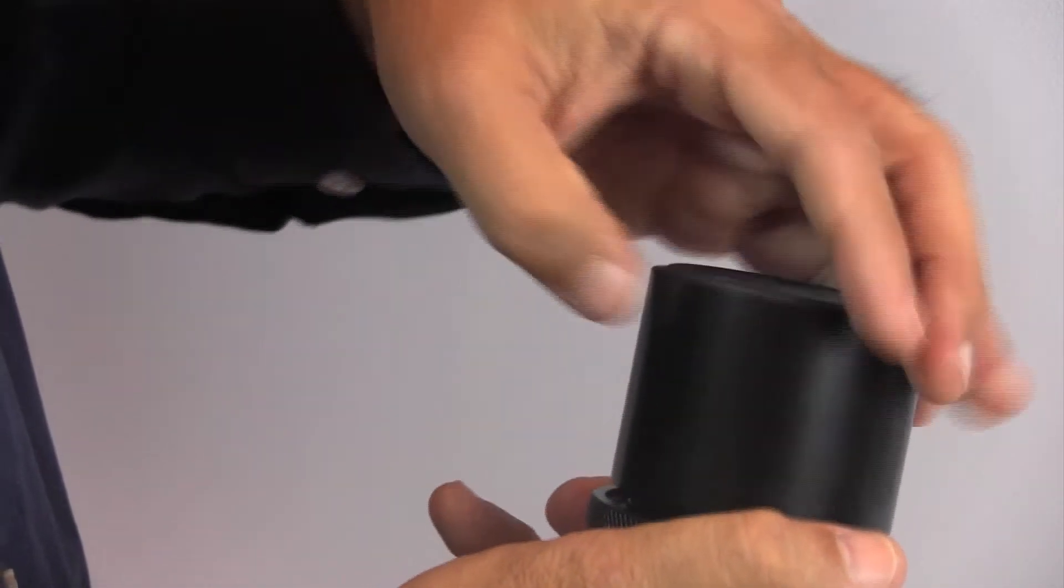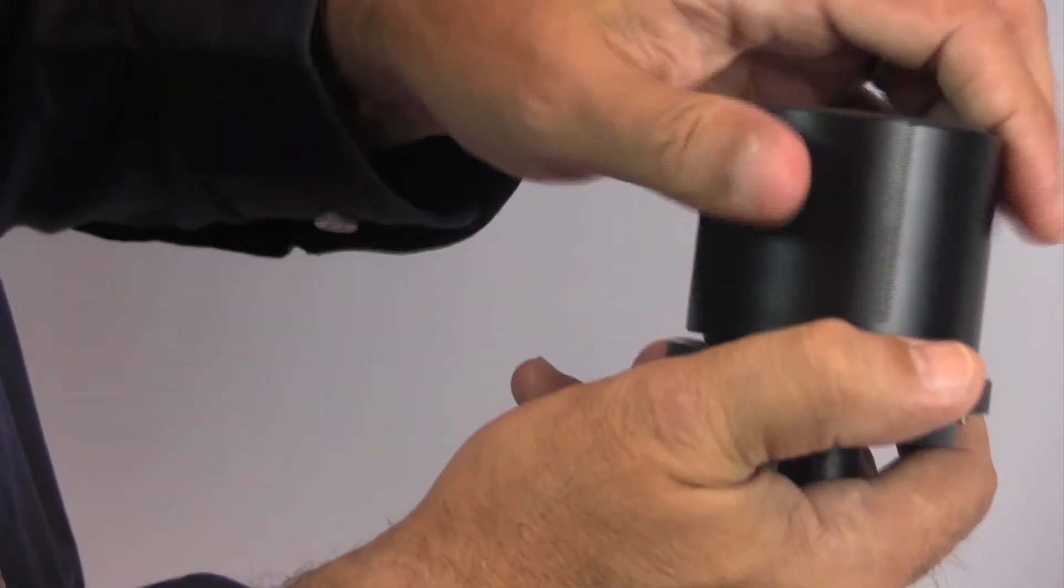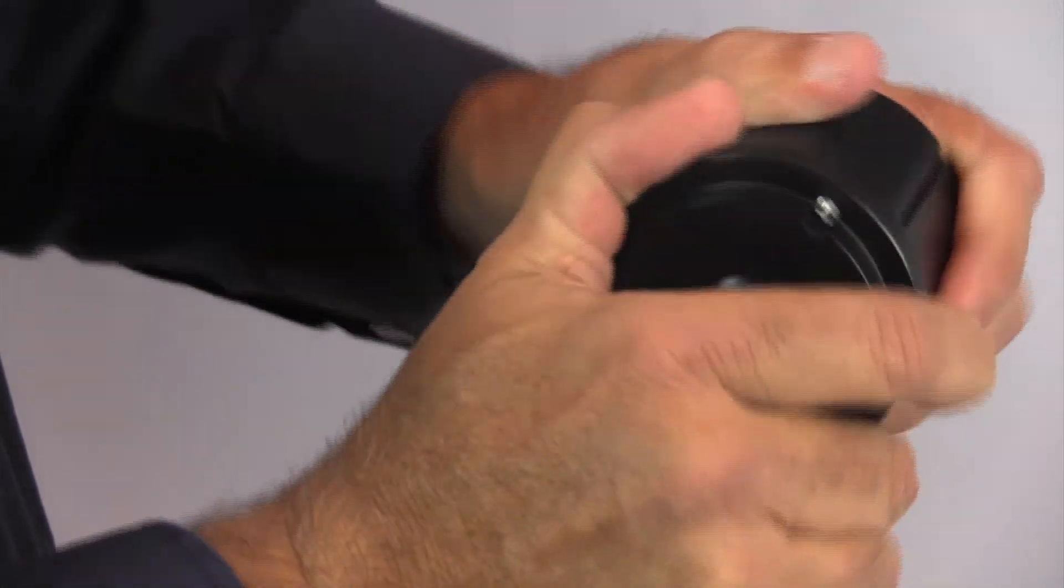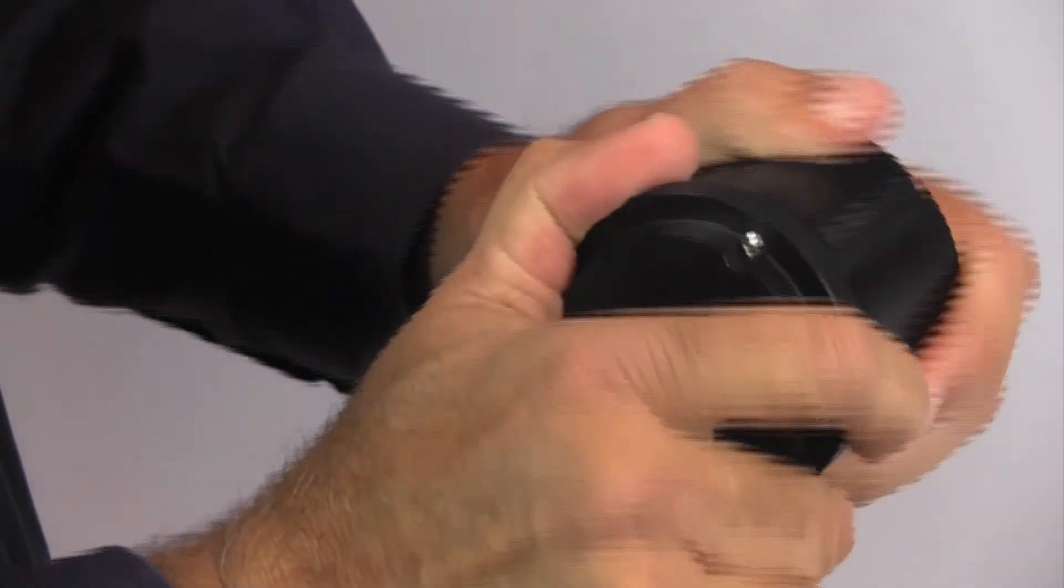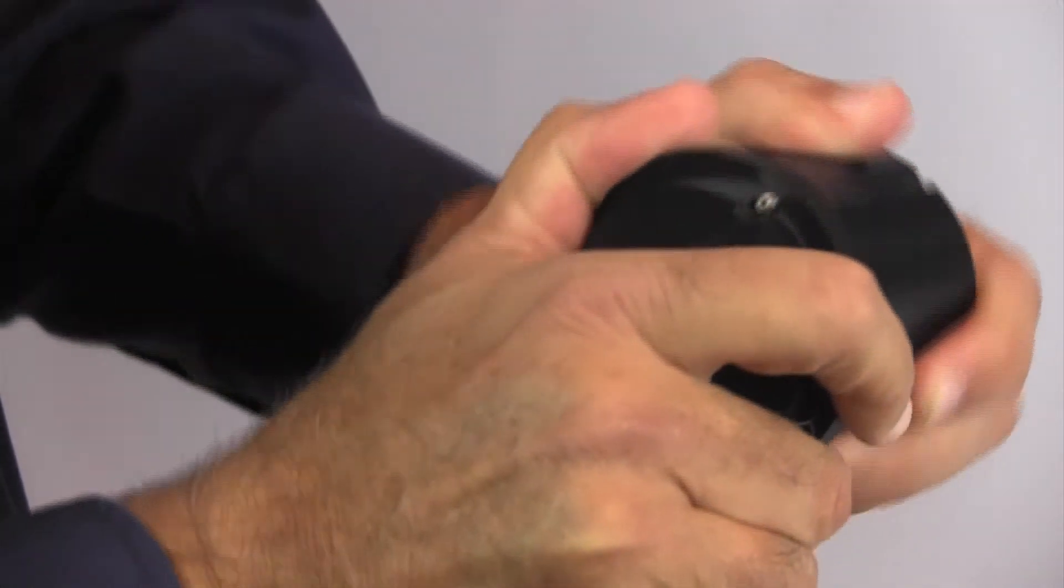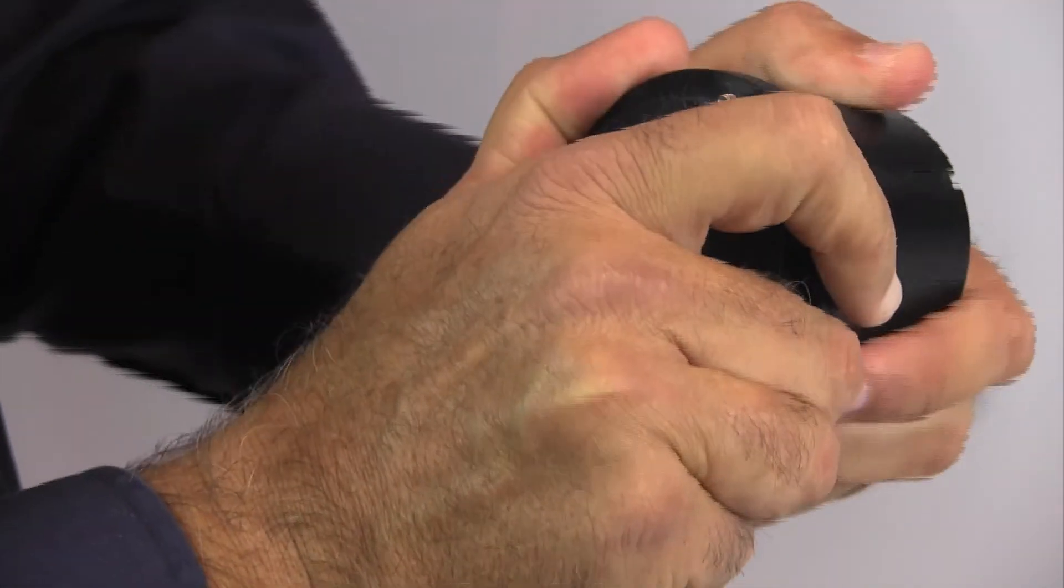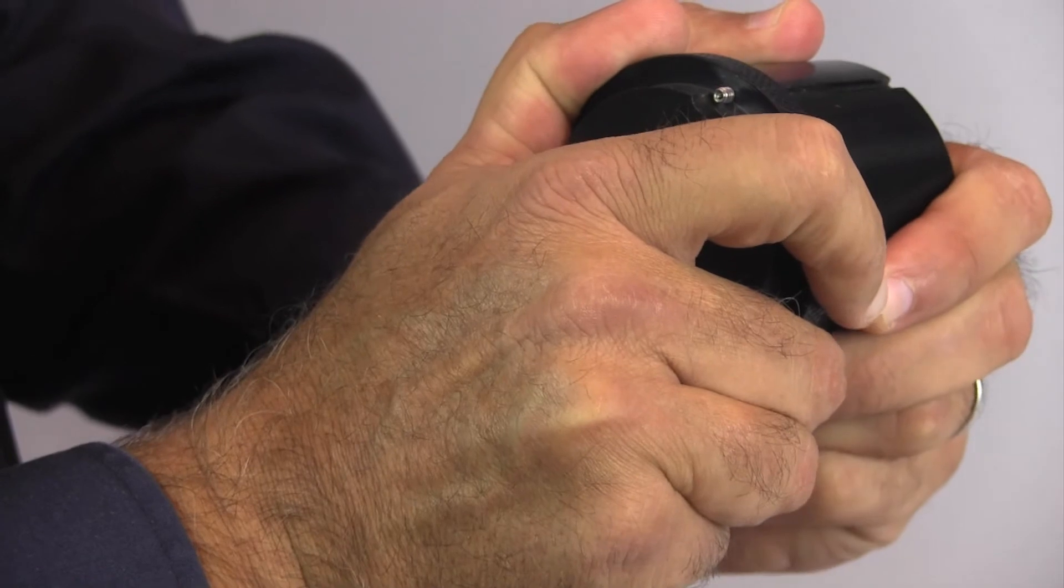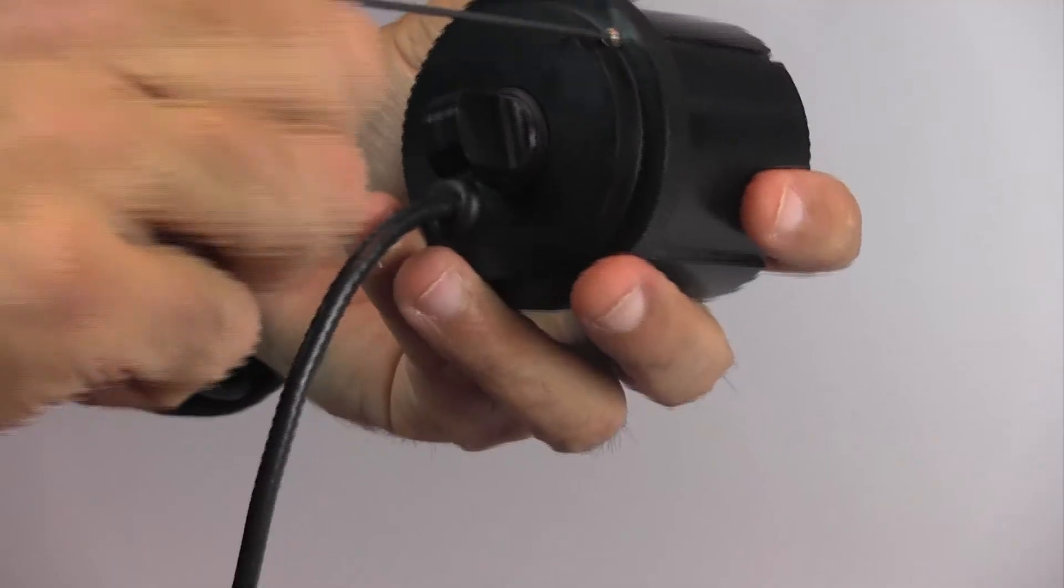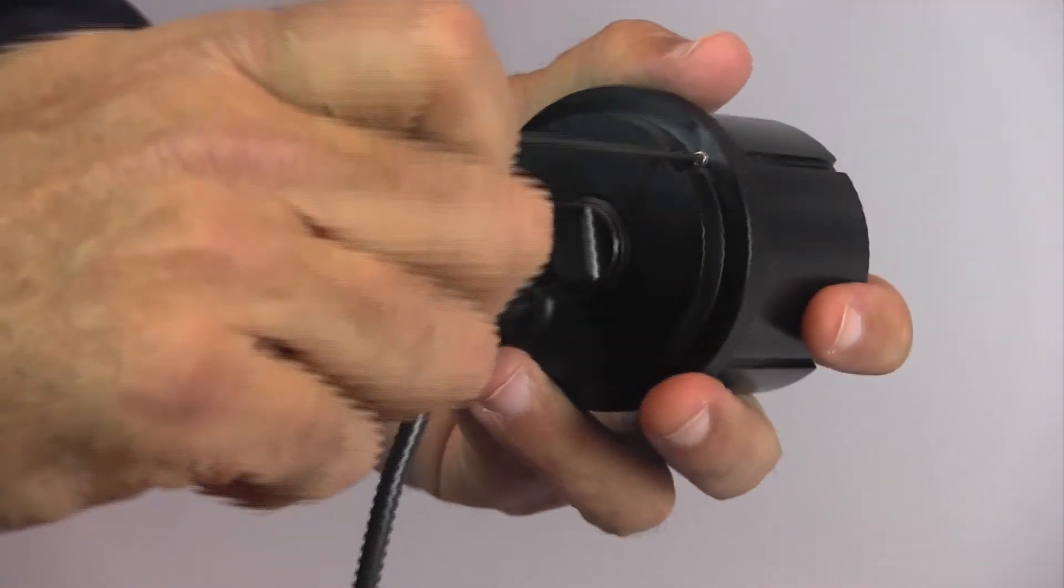Put the sensor housing back on and hand tighten as much as possible. Tighten the set screw.